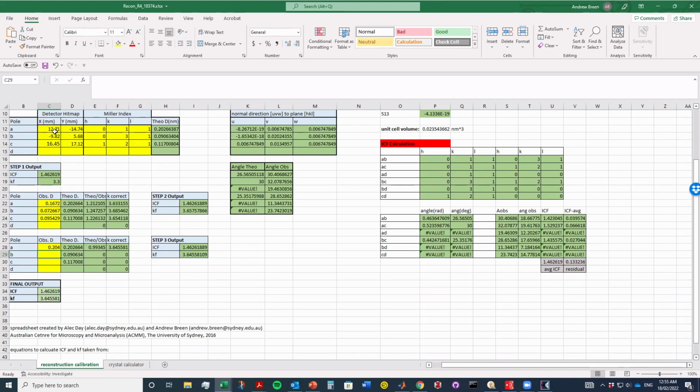So that's what I mean, yeah, it's more of a static reconstruction. It's very highly calibrated around that 1 to 2 million slice, it's going to deviate slightly as you go away from that. Usually, I think that's fine. If you want something super, super accurate for the whole reconstruction, you'd have to go through and do a dynamic, which could take a long time. Hopefully one day it'll be more automatic, but yeah, at the moment.